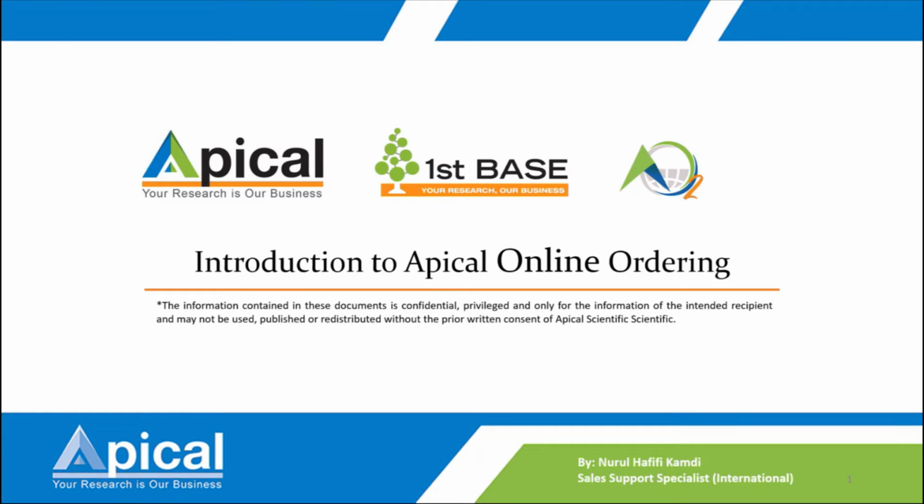Actually, about the sequencing, is Sanger sequencing still prevalently used rather than next generation sequencing because of the limitation of Sanger sequencing? Okay, I believe Sanger sequencing and next generation sequencing both have limitations.